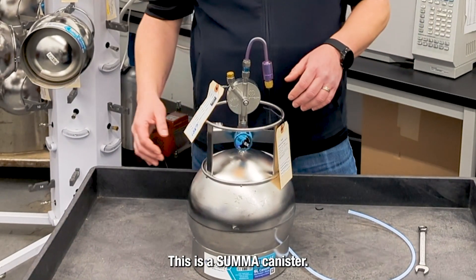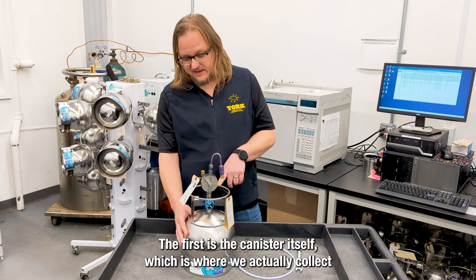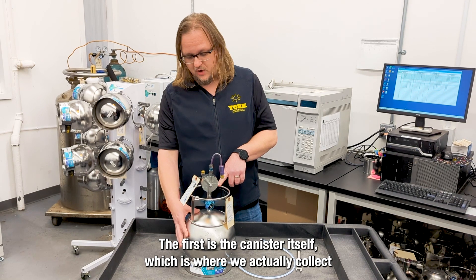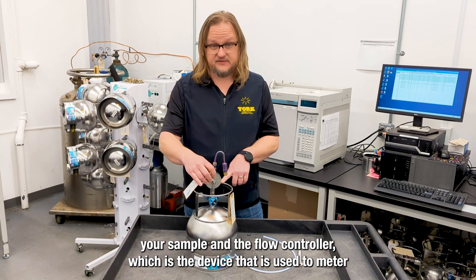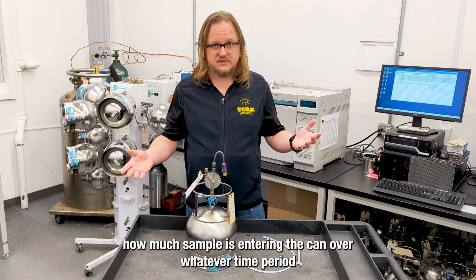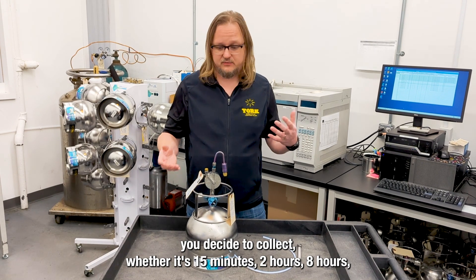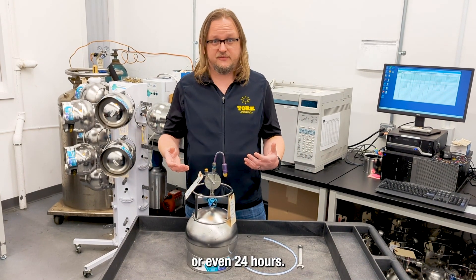This is a SUMA canister. The SUMA canister consists of two main parts. The first is the canister itself, which is where we actually collect your sample, and the flow controller, which is the device used to meter how much sample is entering the can over whatever time period you decide to collect — whether it's 15 minutes, two hours, eight hours, or even 24 hours.